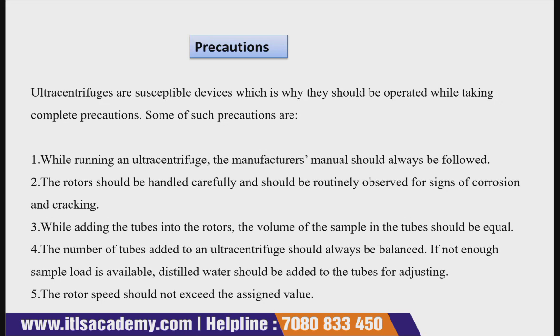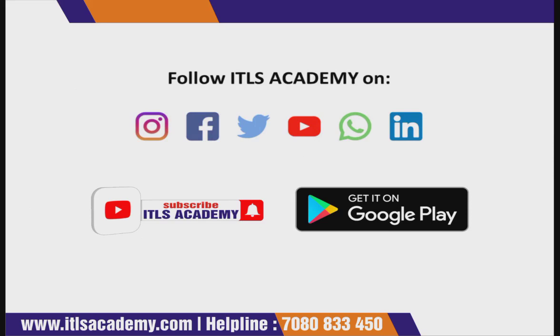The rotor speed should not exceed the assigned value. So these are certain precautions you should always take whenever you are operating an ultracentrifuge. That brings us to the end of the lecture.